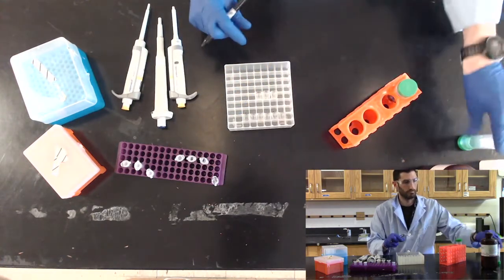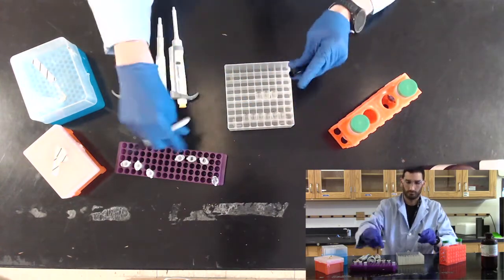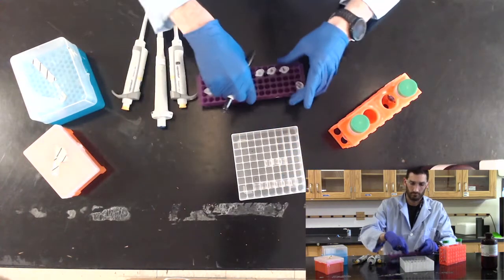Pour Bradford reagent into a clean conical tube. Obtain the buffer that you eluted your protein in and pour some into a clean conical tube.